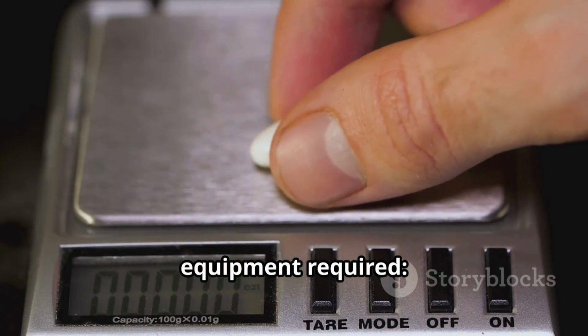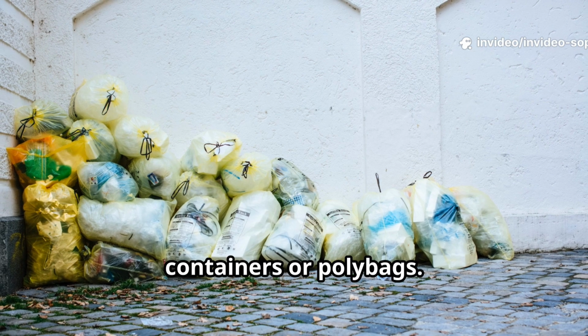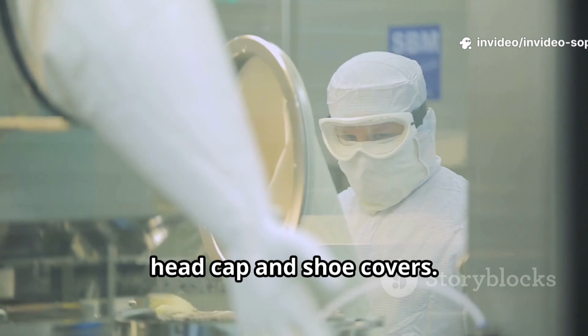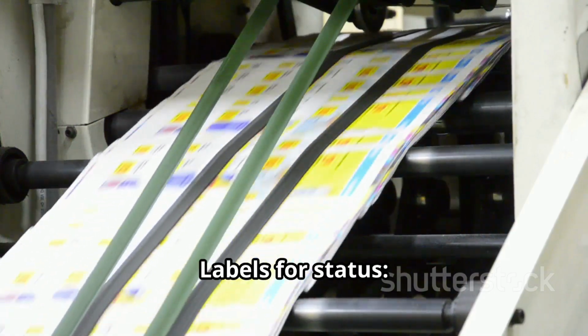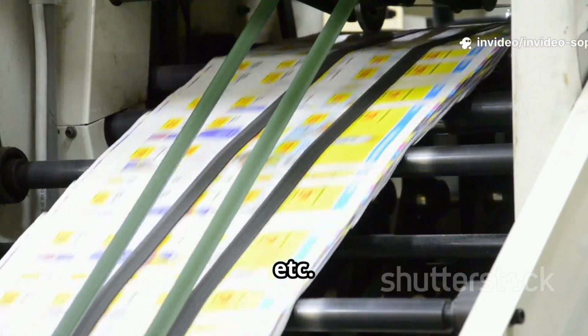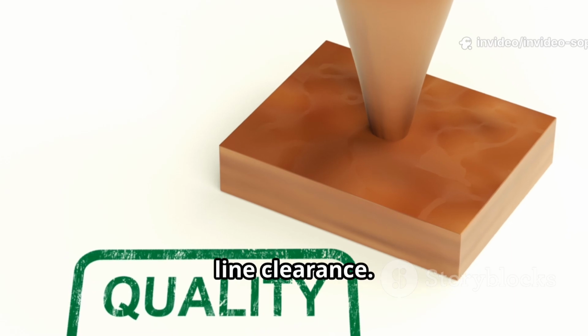Materials and equipment required: a calibrated weighing balance, clean and labeled dispensing containers or poly bags, PPE, gloves, mask, gown, head cap, and shoe covers, dedicated scoops and spatulas made of approved materials, labels for status: dispensed, under dispensing, rejected, etc. Pre-dispensing checks: ensure area and equipment cleanliness with QA line clearance.